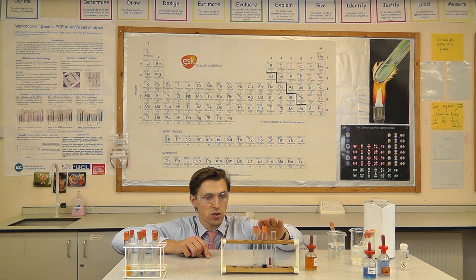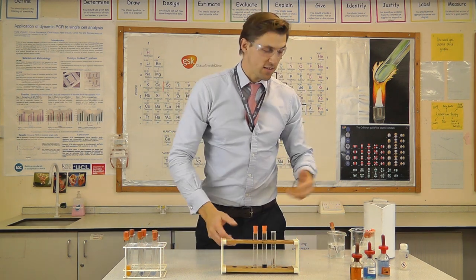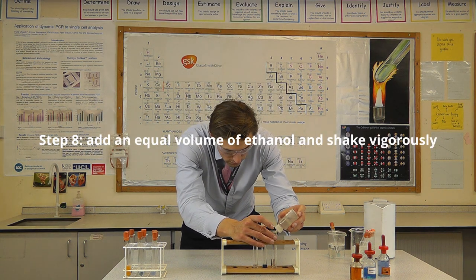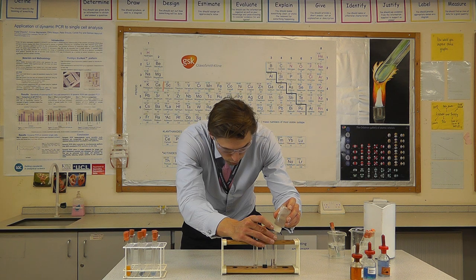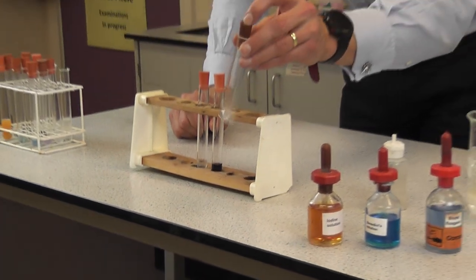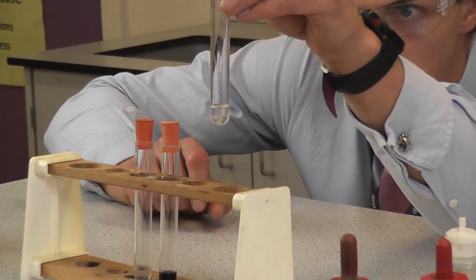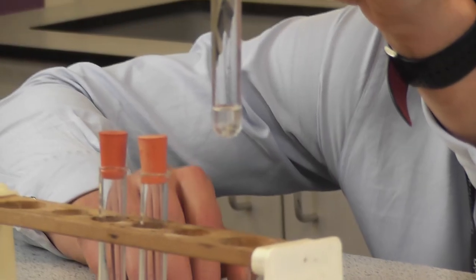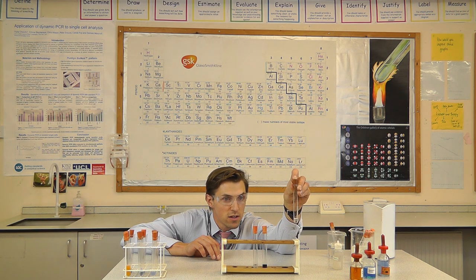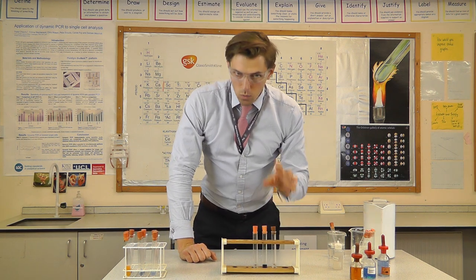The last test is for lipids — fats essentially. I'm adding a few squirts of ethanol. If an emulsion is formed, that's a positive test for lipids. Giving it a shake, there is no emulsion formed for the biscuit solution. We wouldn't necessarily expect that with a biscuit — it's going to have sugars and starch, but not necessarily fats. With our cheese, however, we may expect a different result.